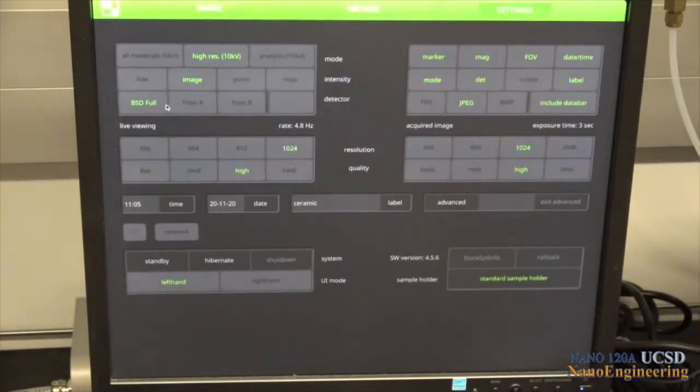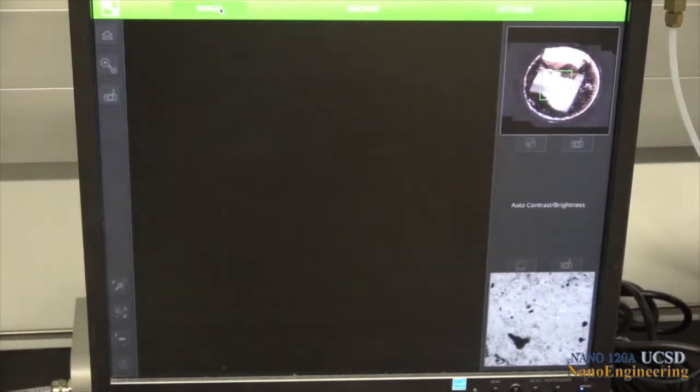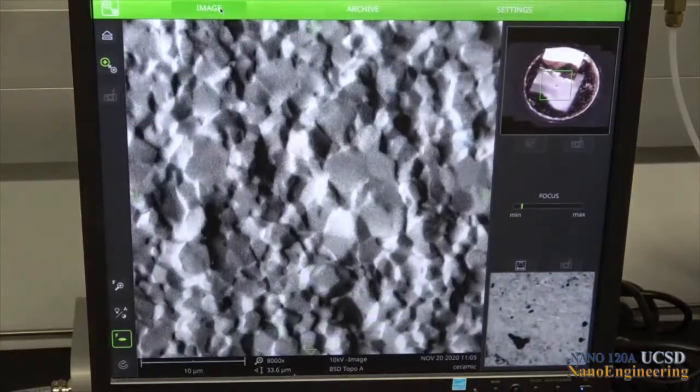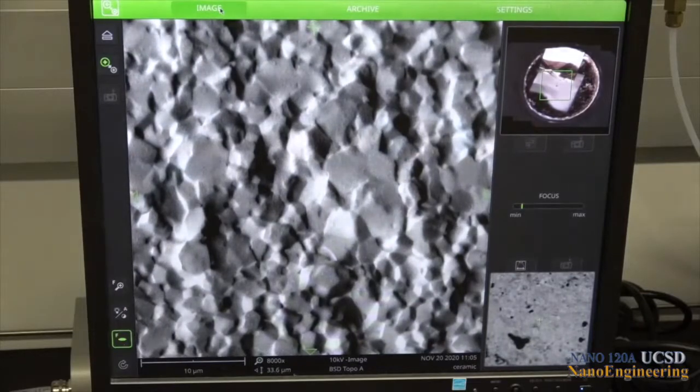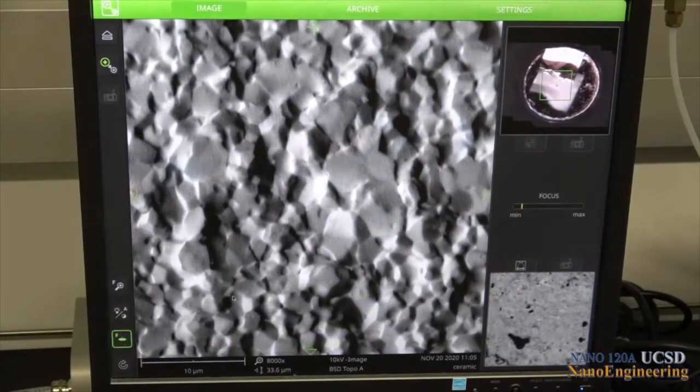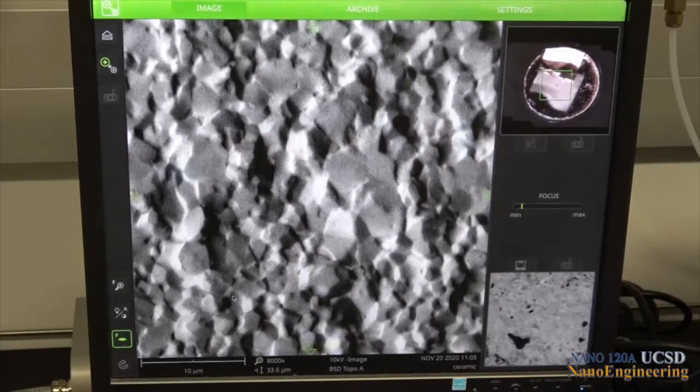To view the same surface in a topographic contrast mode, we can go back to our settings menu and in the detector portion, choose topo A and then click on image at the top left of the screen. A topographic image of the surface is observed from turning off certain segments of the backscatter detector.